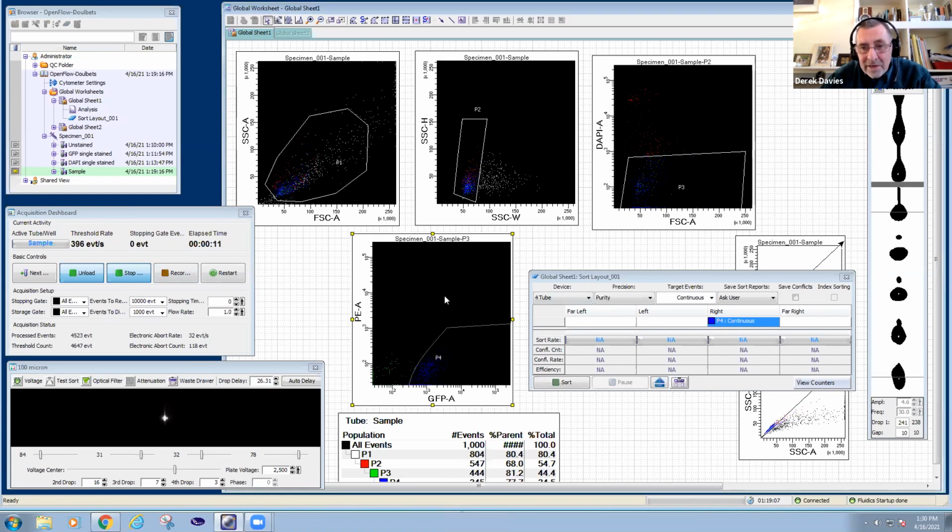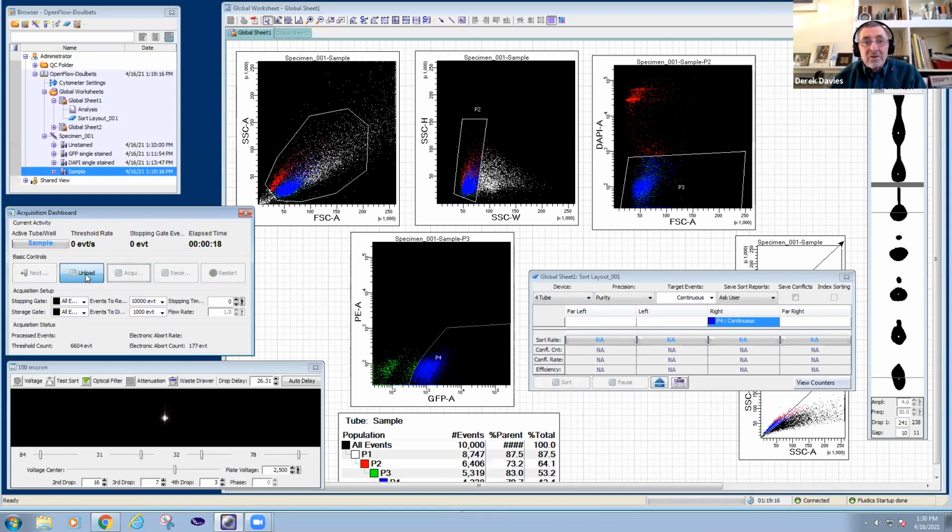And it may be an experiment that you have to perform to work out what's the best, which gives you the best resolution post fixation, because fixation as well, of course, is going to affect your cells and potentially will increase autofluorescence. So that may be something that you have to experiment with. I hope that answers the question.